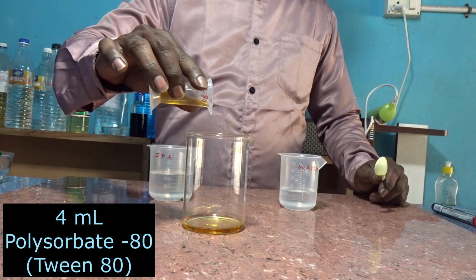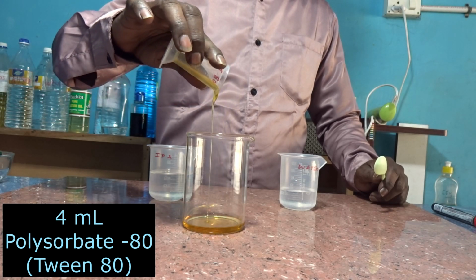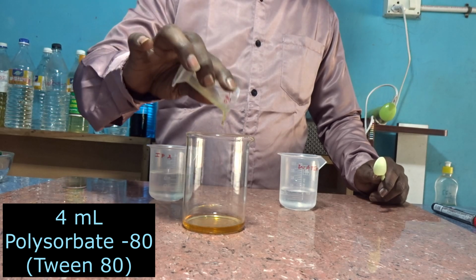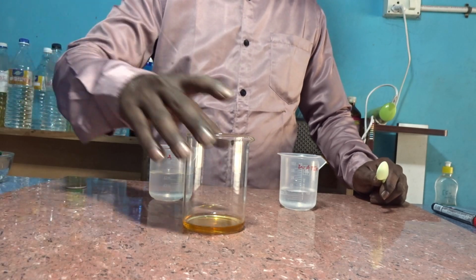Now I am adding the Polysorbate 80 and both are completely miscible. I am getting a homogeneous solution. So this is one important criterion.